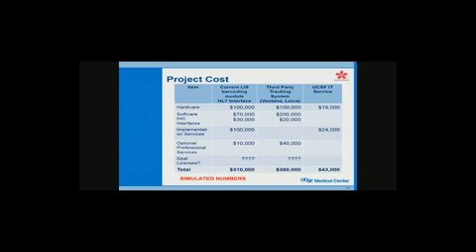When I say capital approval, this is the kind of money we're talking about, and these numbers, I'll have to say, are simulated. I kind of rounded some up and some down. Some of them are real, some aren't, but just to give you an idea of what you're looking at for a commercial system. And probably the thing I really want to point out is that we initially looked at using a third-party tracking system, for instance, Ventana Vantage or Leica Cerebro, because the system we had at that time, which we still have, is Cerner CoPath Plus. Their barcoding system that they were offering was very rudimentary, and Ventana and Leica were just light years ahead of them as far as capability.